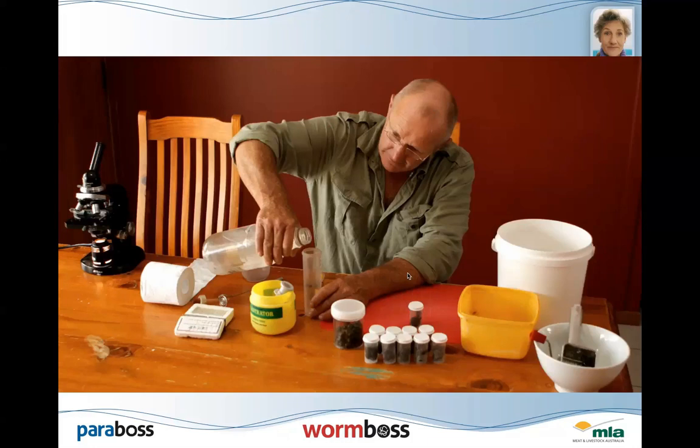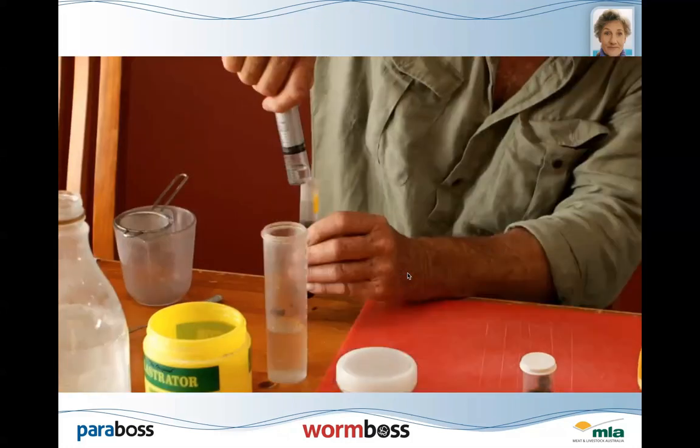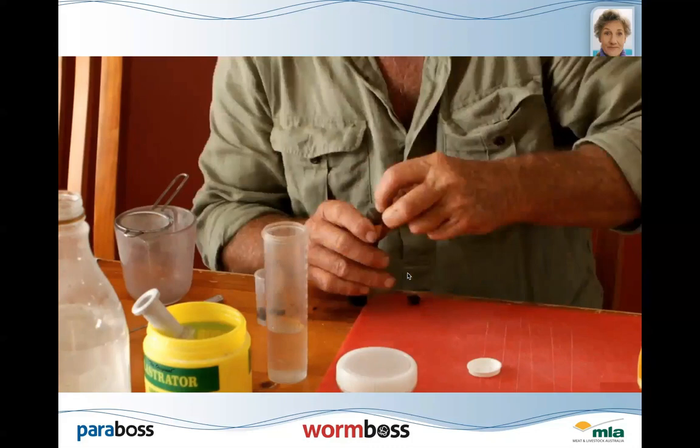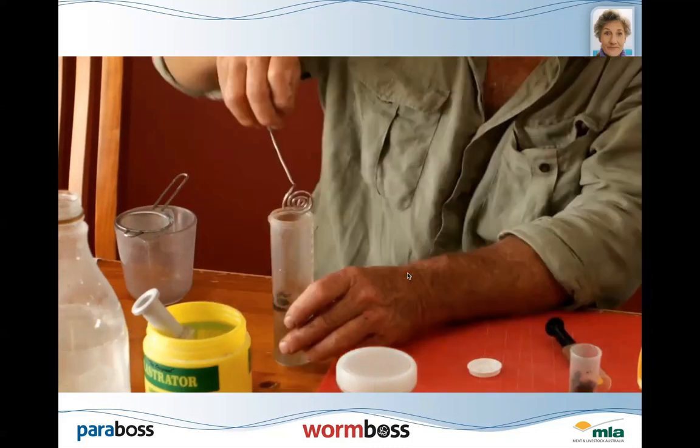Murray is putting some saturated salt solution into a container, and then he's using some of that to measure out his feces. He's using a displacement method, but sometimes other people weigh the sample. And then the fecal sample goes into the container. He gets his little mixer, gives it a really thorough mix.